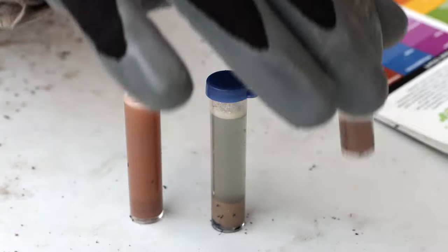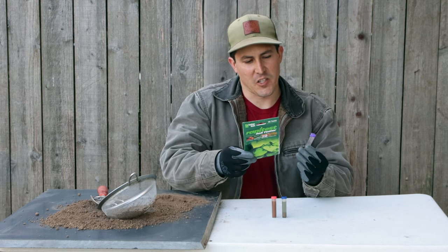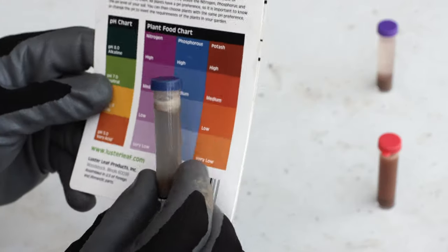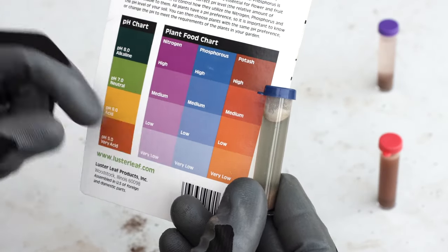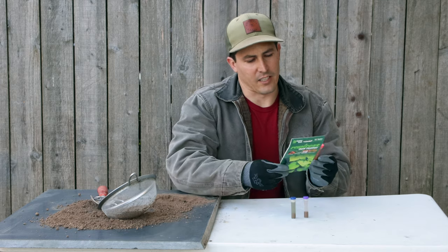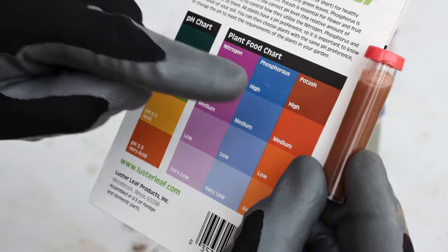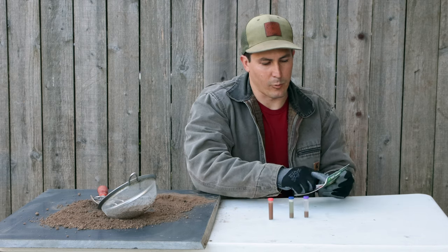It's been 10 minutes — time to use this color chart to see where we're at with these samples. Nitrogen barely changed color at all; it looks almost clear, so I'm going to call that very low. Phosphorus is also pretty clear — it's got more color than the nitrogen, but I'd still put that in the low to very low range. And the potassium didn't clear at all — it's still really cloudy, but based on the color I would say that's high in potassium. So: high potassium, low phosphorus, low nitrogen, according to the Rapid Test Kit.